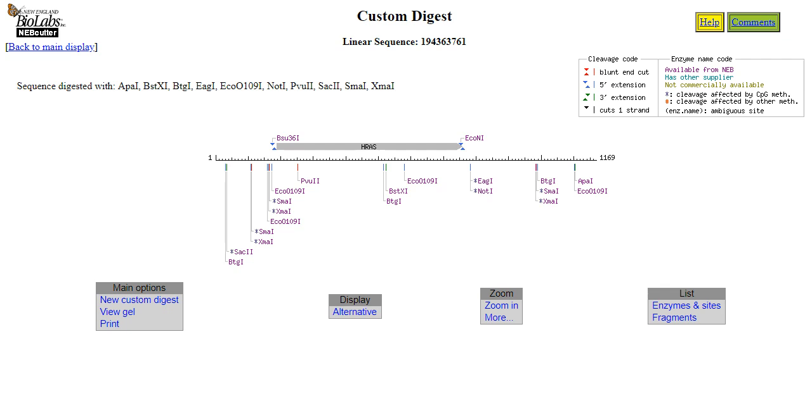All right? Sma1 and Xma1 are both here. Right? One cuts at 165 and one cuts at 163. Now, I said pick the one that's closer to it. According to this instruction, who would I pick? Xma1 or Sma1? According to that rule, Sma1, okay? But if it wasn't a real lab, I'd actually pick Xma1.